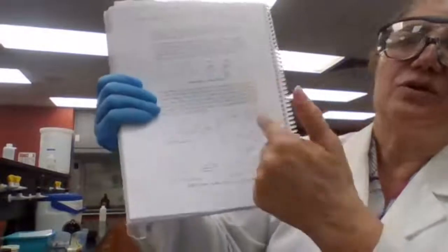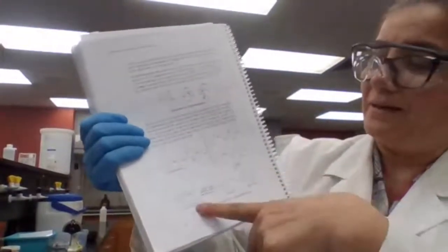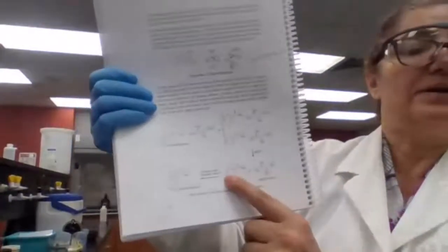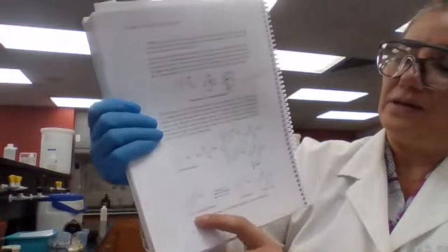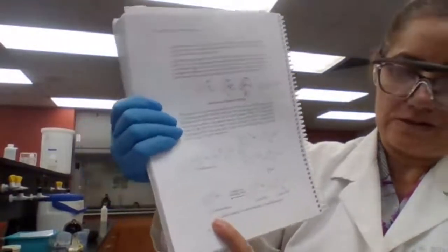When we change them to diastereomers, then we can separate them by physical means. Then we are going to break the bond between the agent and our pure enantiomer, because we have now only one of them, and we recover the compound of our interest based on the design of the experiment.